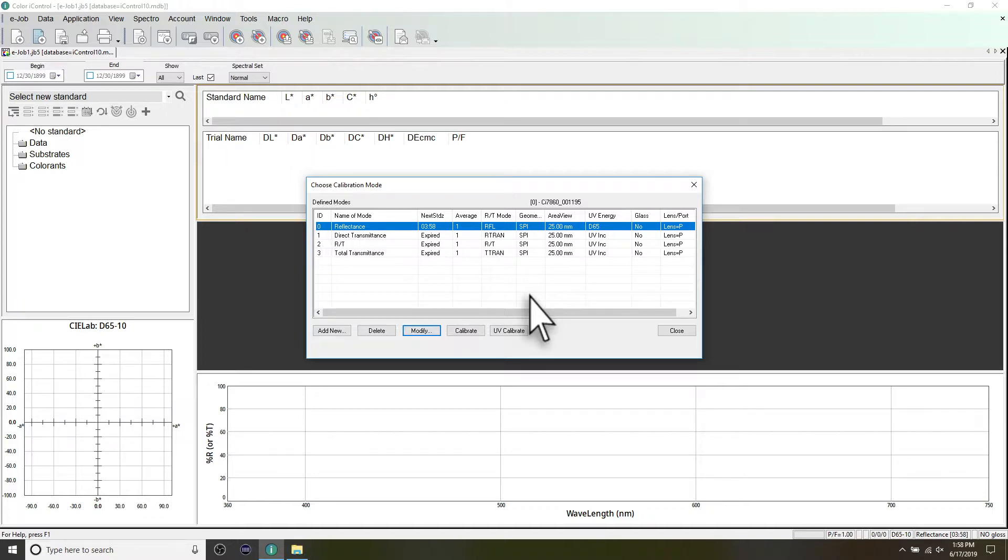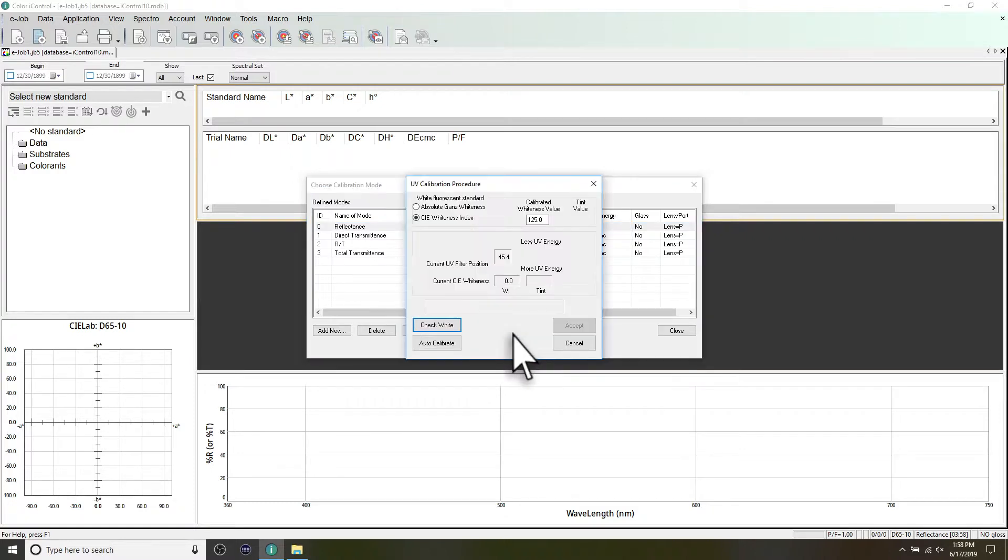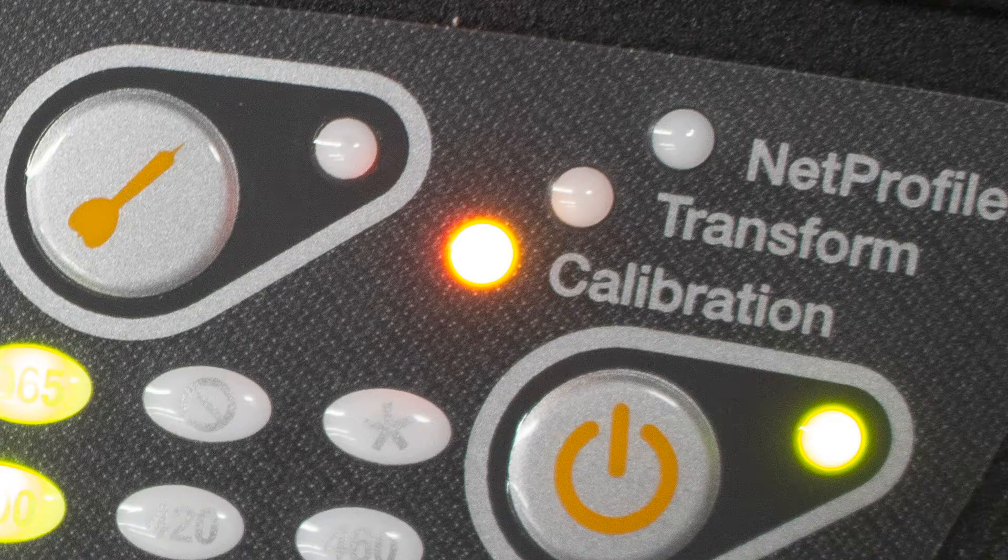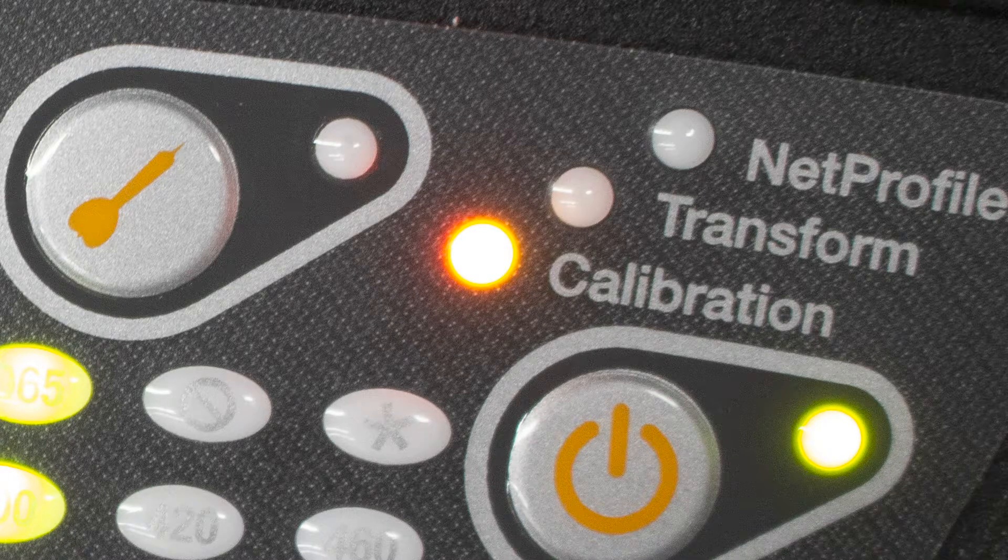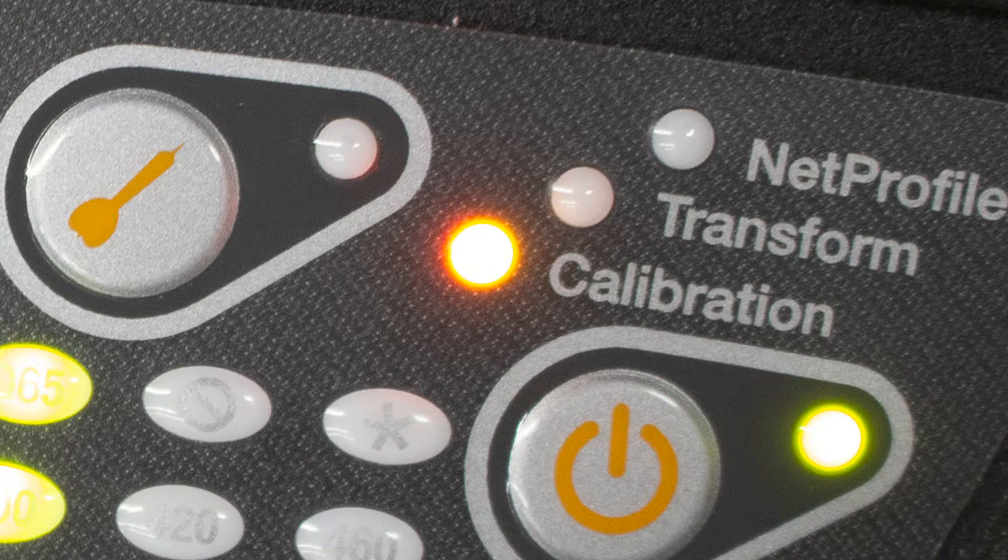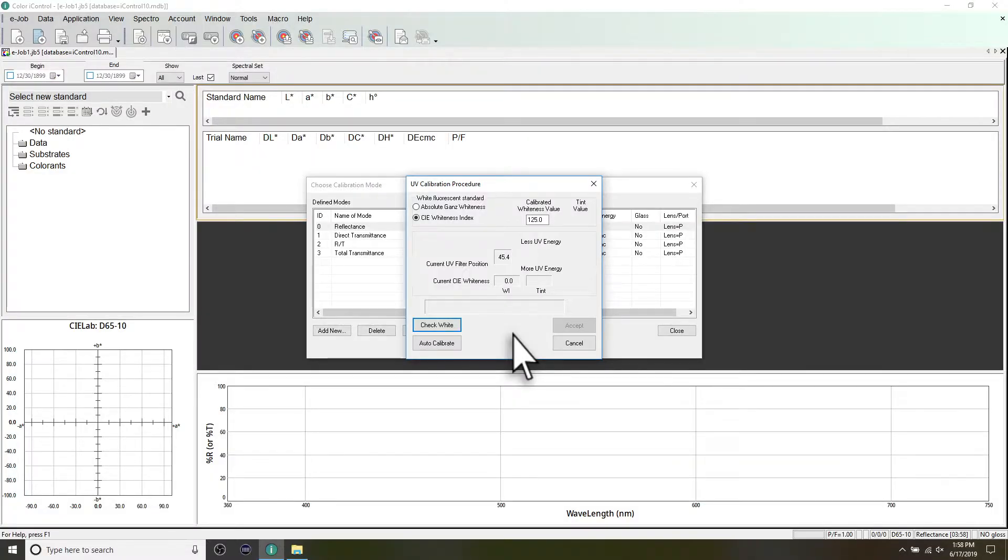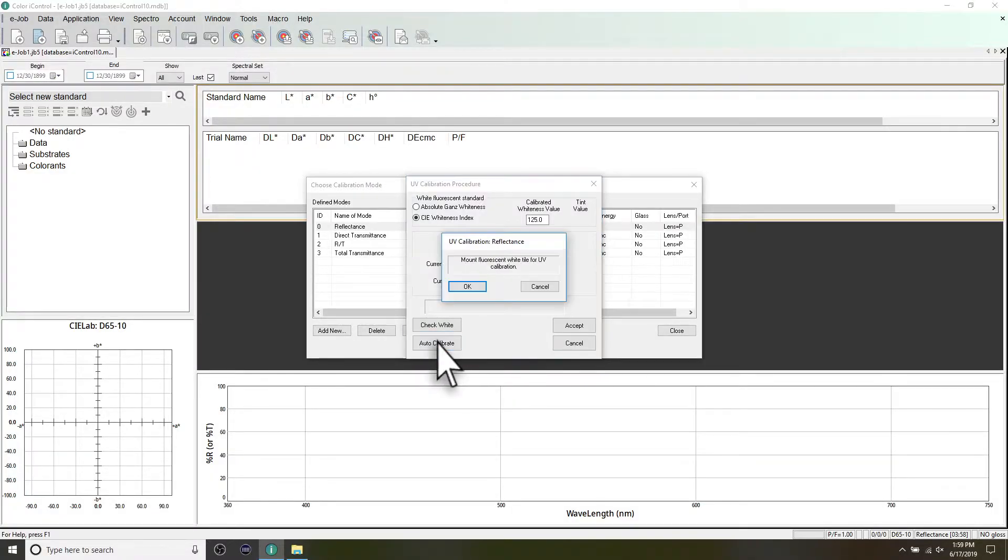If you are using your instrument in UV-calibrated mode, you will also need to measure your UV-calibration tile. The calibration light will appear amber if your UV-calibration has expired. Inside the UV-calibration window, click Auto-calibrate.